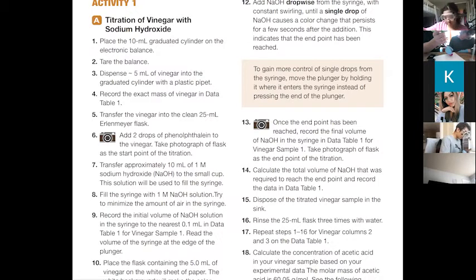Is that it? Yep. There it goes. Okay, so a tiny 5.15. So we subtract that from 10, and that's 4.85 mils. Okay, excellent. That took a while. It did.